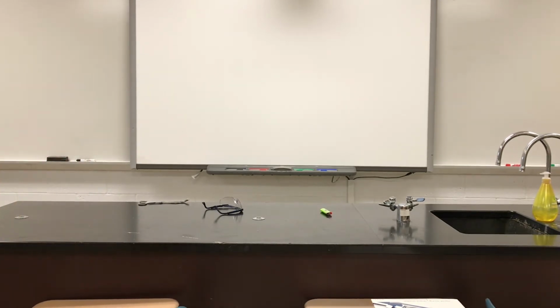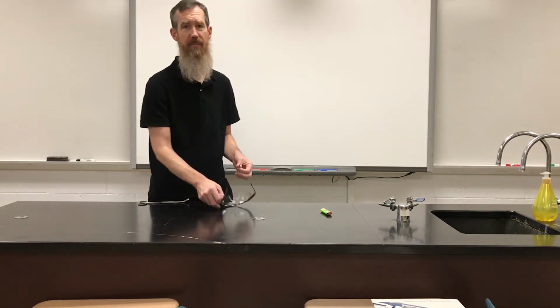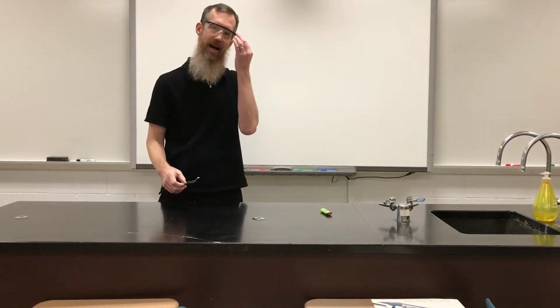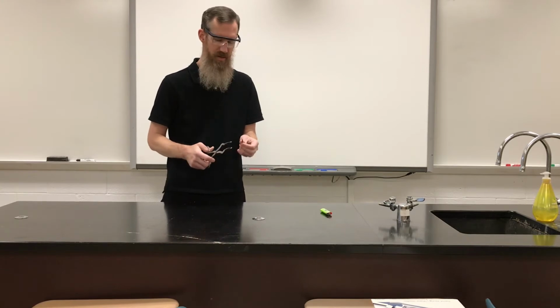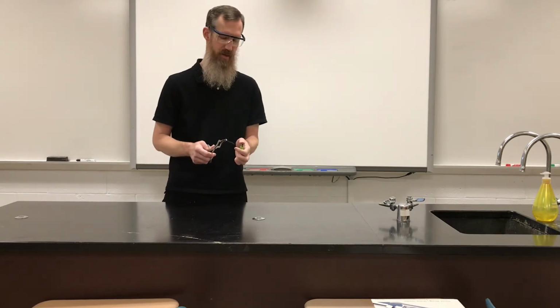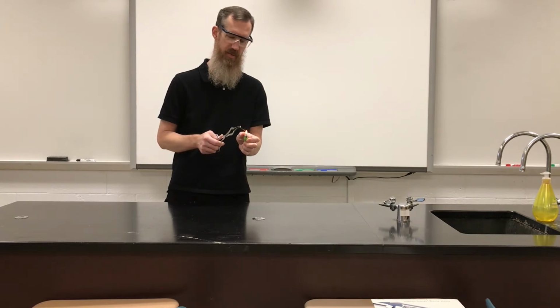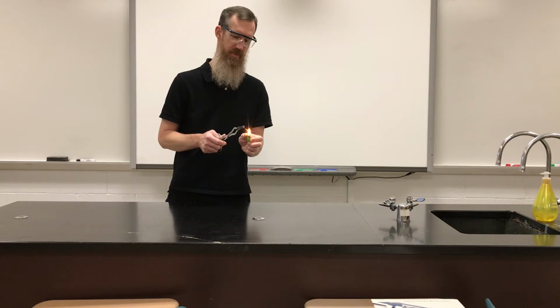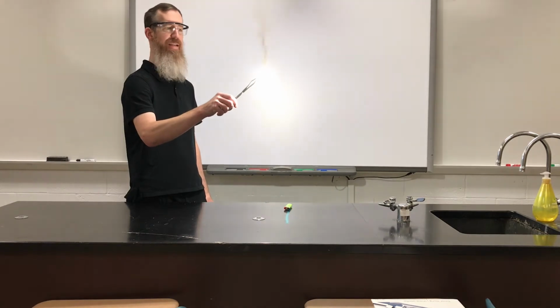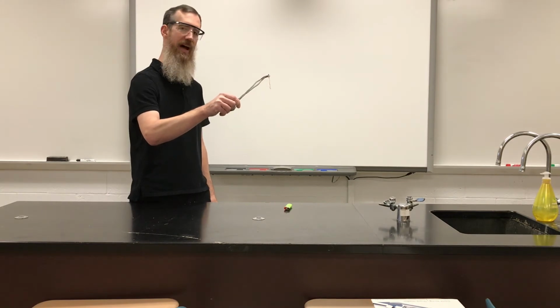And what's interesting about this particular metal is, again, pure magnesium, so the element Mg. You think of most metals, you heat it, they get hot, maybe you start to melt the metal. But magnesium metal has an interesting property: if you've got a hot enough flame, so I can't use a match, not that anybody uses matches anymore, I've got to use a lighter. But if I heat it enough, it burns. It burns a very, very hot white light. It burns in the presence of oxygen.